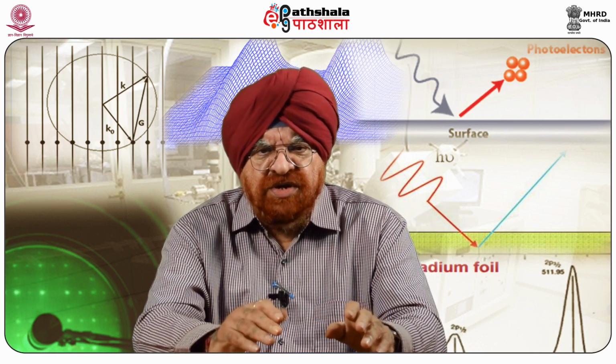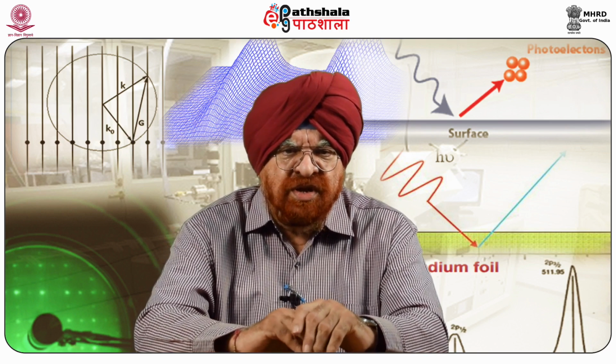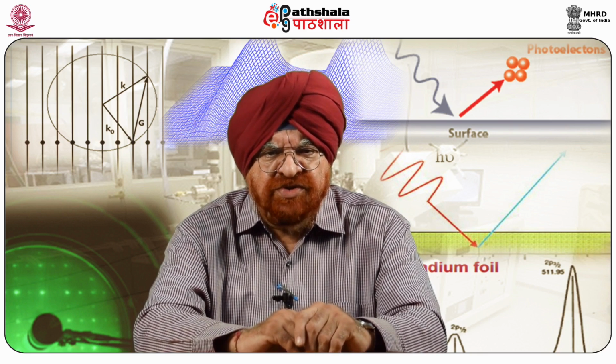Photo-emitted electrons can undergo various processes like inelastic collisions, recombination, recapture or trapping in various excited states within the material. This causes a reduction in the number of escaping photoelectrons. Once these photo-ejected electrons are in vacuum, they are collected by an electron analyzer, photomultiplier tubes, or hemispherical detectors that measure their kinetic energy.